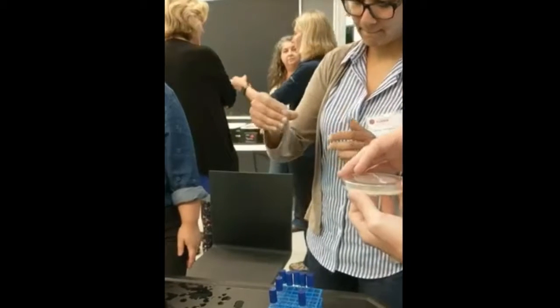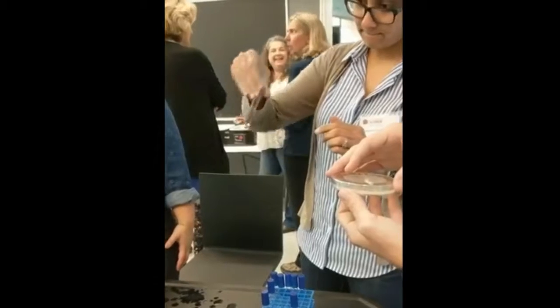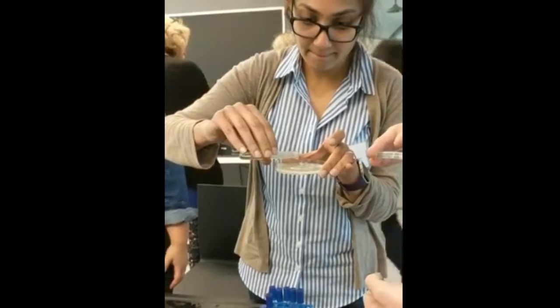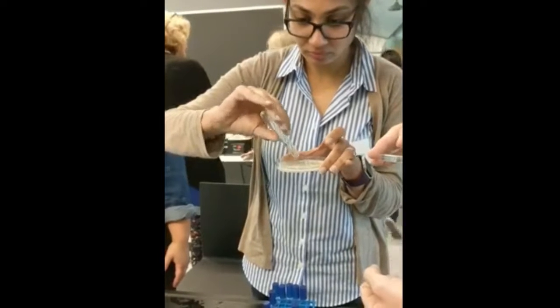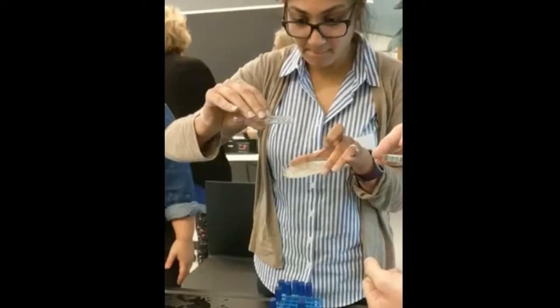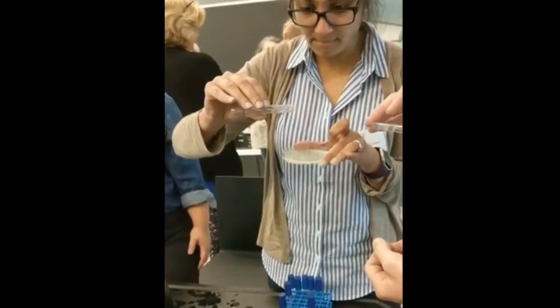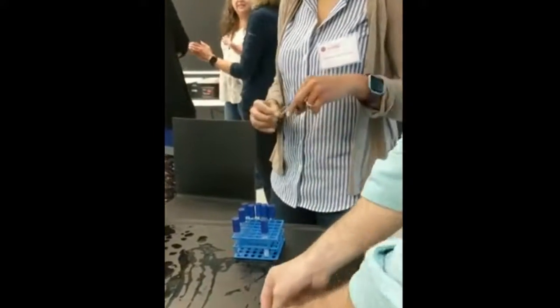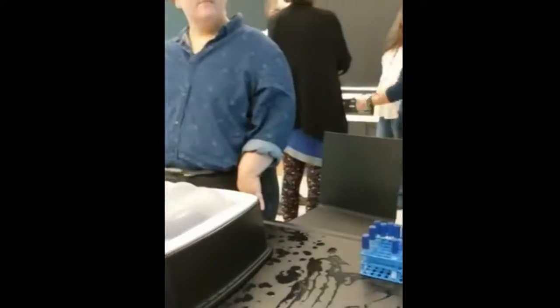You might be wondering at this point, what is LB broth? LB broth is the nutrition media for these organisms, microorganisms. It's basically Gatorade, okay? There's mention of this other kind of Gatorade called tryptone, but that's not quite as great as the LB broth in terms of feeding the microbes.